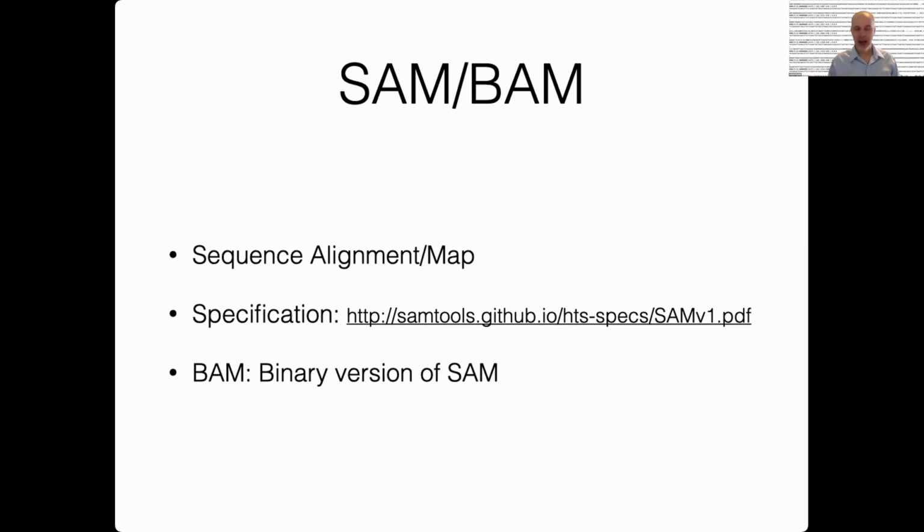There's software for doing that, and it's not lossy. You don't lose any information. You can go back and forth between a SAM and a BAM 20 times, and the file that you started with will have the same information as the file you end up with. It's just a slightly different format. BAM files, in addition to being much faster for a computer to read, almost always take a lot less storage space than SAM files.